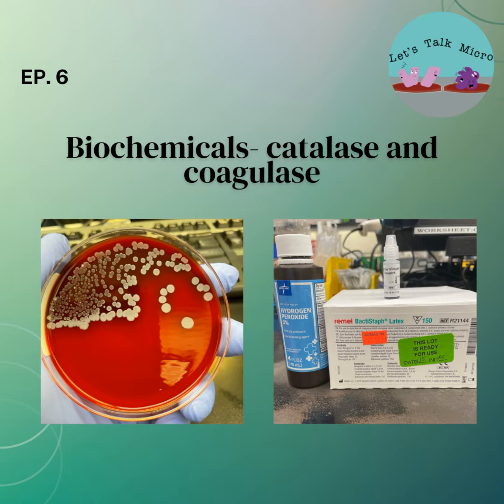When I get to the Enterobacterales, I'll be talking about the TSI, and we don't use it as much here in the US, but it's definitely important for you to know it if you're a student. So when you take your boards like the ASCP, American Society for Clinical Pathology, you need to know this. So I'll be going over that.